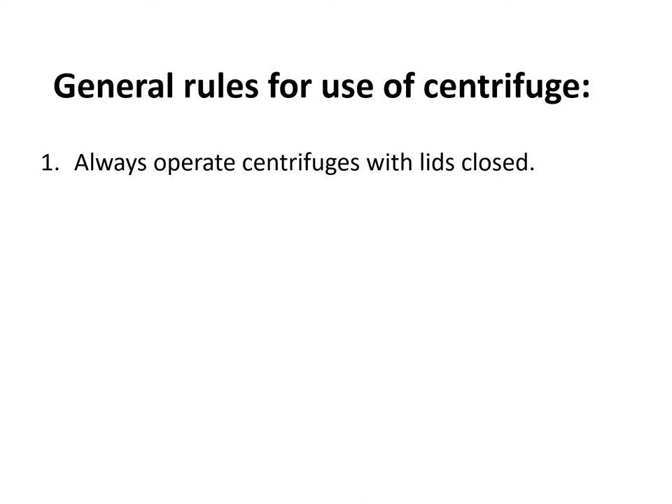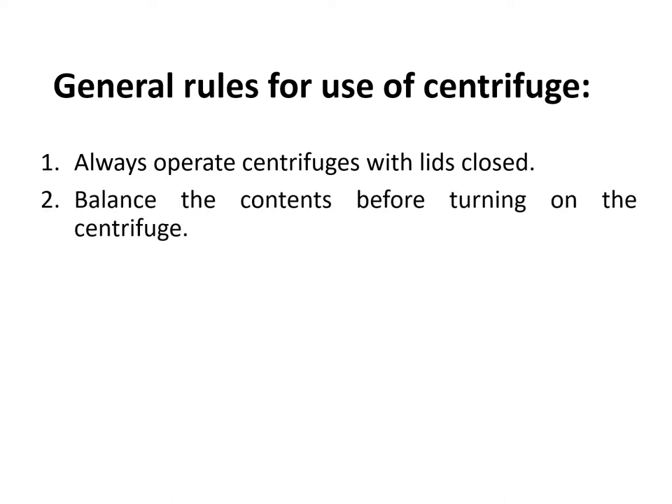Here are some general rules when using the centrifuge. First, always operate centrifuges with lids closed — this protects the operator from accidents that may result from sudden breakage of glass test tubes and also prevents inhalation of aerosols. Second, balance the contents before turning on the centrifuge. It is important to place tubes opposite each other and also to compare the amount of sample in each tube so they are equal and balanced.